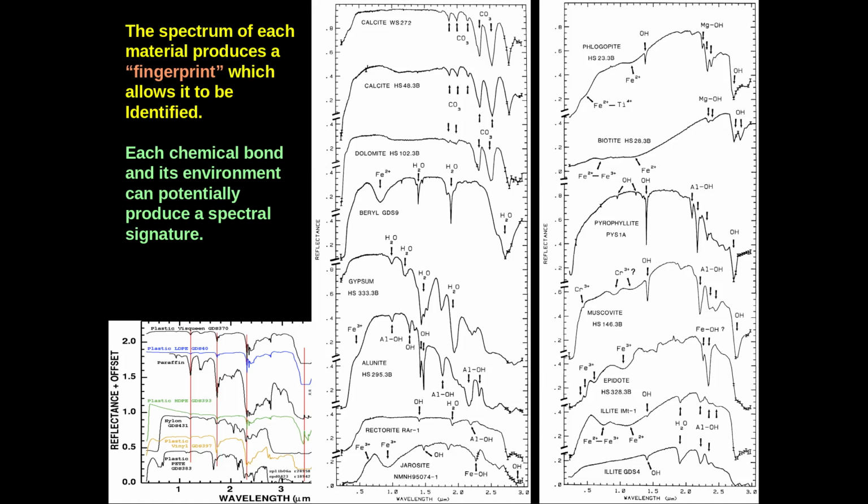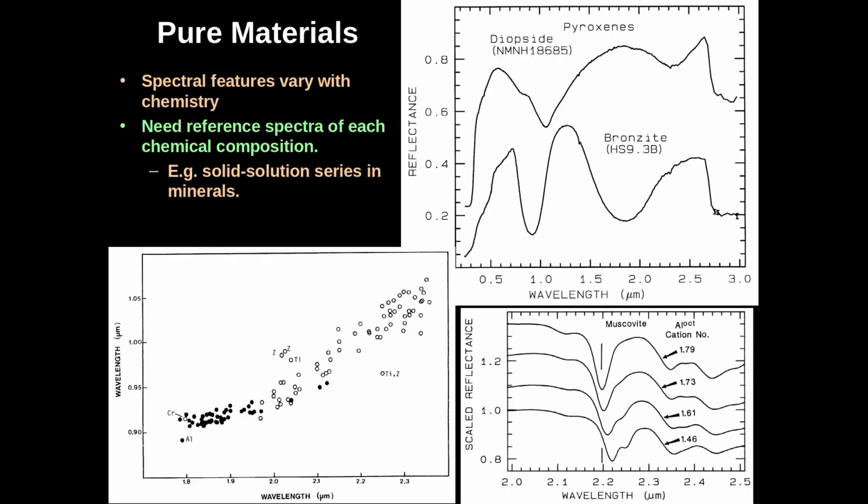Another case that we've seen is where we would see one area where we'd get excellent fit and high response, and another area with the same mineralogy where it would be uniformly lower fit. And when we investigated, we'd find that it's typically a small wavelength shift because the chemistry had changed a little bit. And then knowing that chemistry change, we can then go get that compound with that chemistry, measure the spectrum, and add that to the reference spectra, and then be able to map finer details in chemistry.